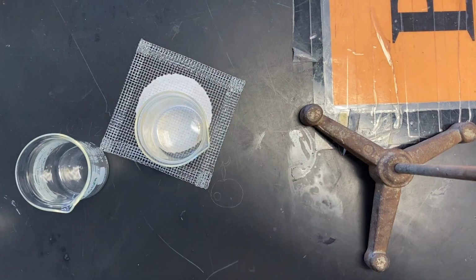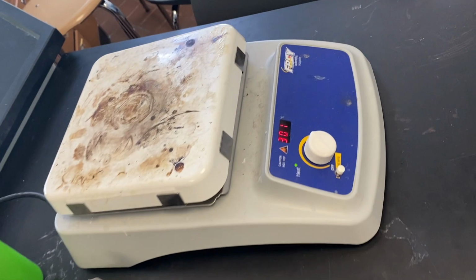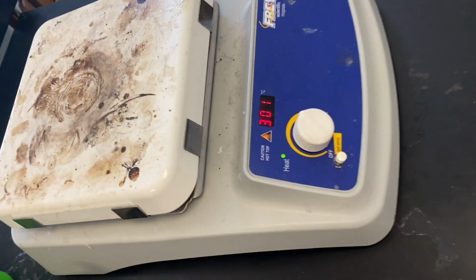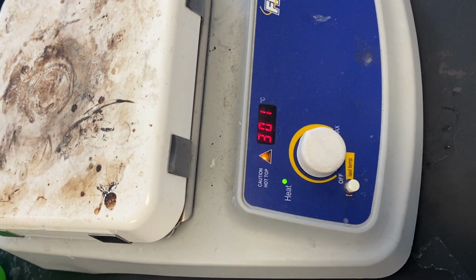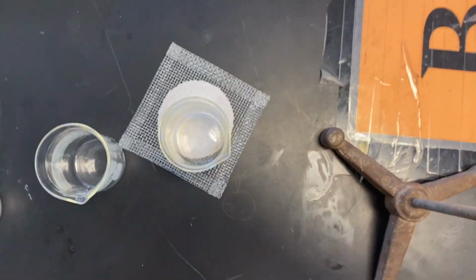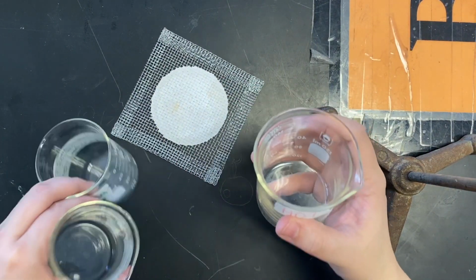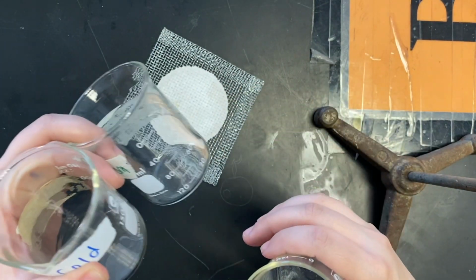So one of your first steps is to turn on your hot plate, plug it in, make sure it actually turns on, and you're gonna set it to about mid to high heat, okay? We're not gonna boil anything today, we just want it to be warm. Now, once your hot plate is on, you're gonna fill up all three of your beakers about halfway with water from the sink.